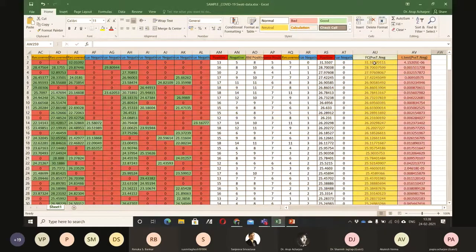This is completely curated data, which I told you that we cannot just push in any data set, you can do that just for understanding how the software works. But once you have your own experimental data, please follow these steps. You have to do the data cleanup properly, because if you throw in any wrong data set, the results will all come out wrong.